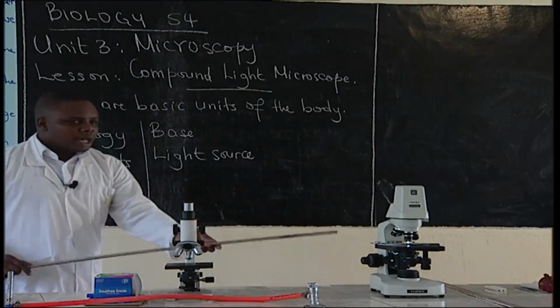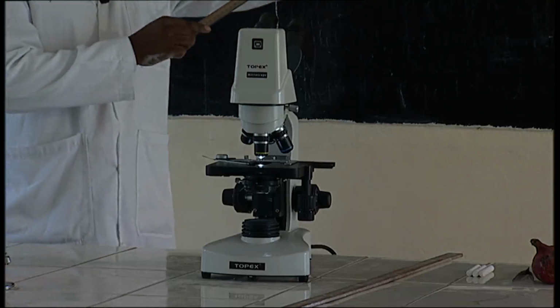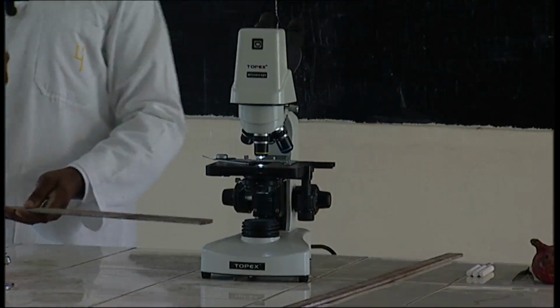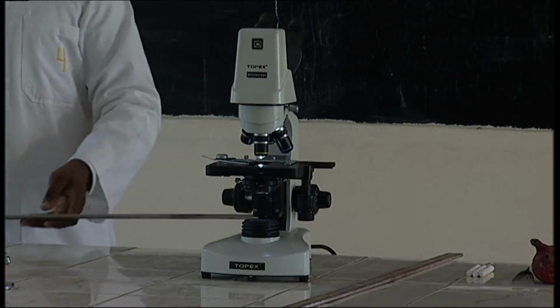Remember, this one we have called a compound light microscope, which means it uses light. So the function of the light source is to provide light, which is needed by this microscope.